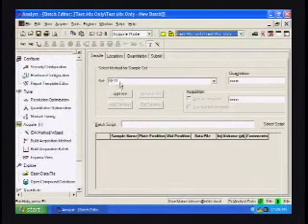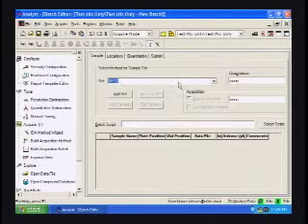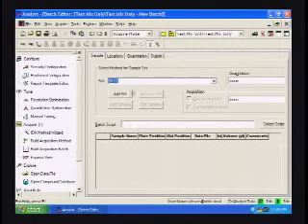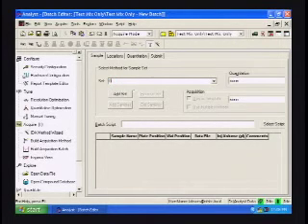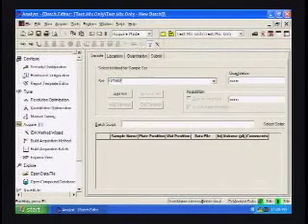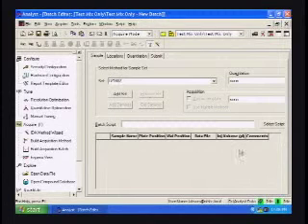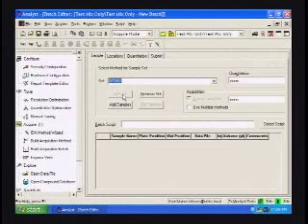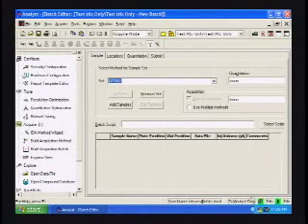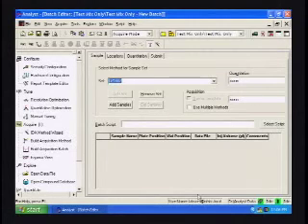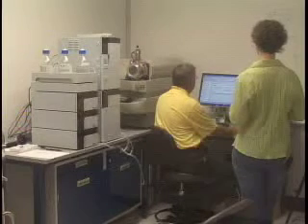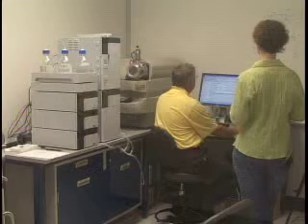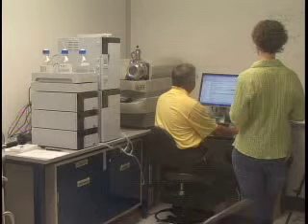So the first thing we see is we want to give the set a name. This is the name. Let's give it today's date. And we'll click on add set. I think you need to select the method. Yeah, but I can't get to it. There you go.